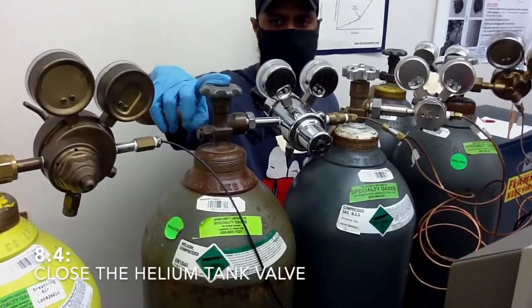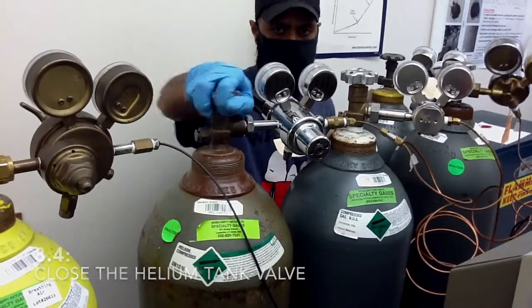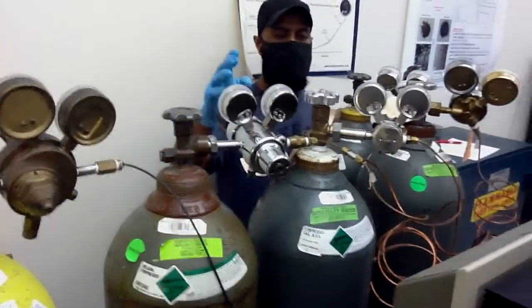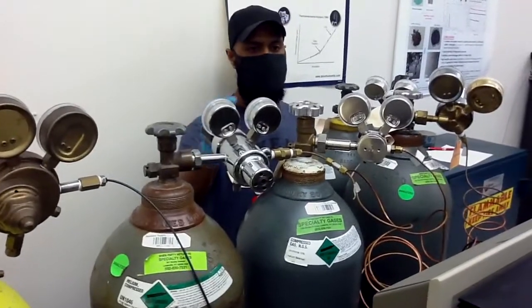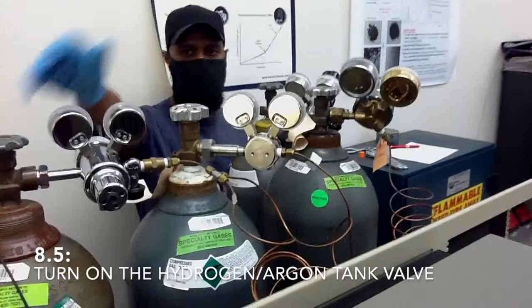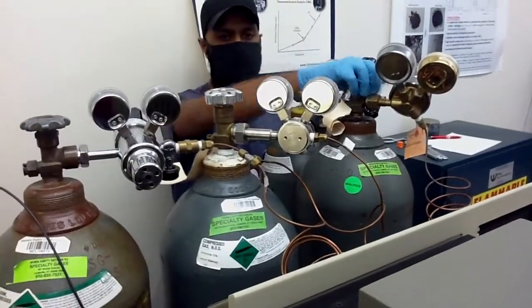After your experiment, close this tank valve once again. So we turn on this valve, and same thing will happen when you change the gas to like ammonia or to hydrogen or helium. You turn on that valve, that's it.